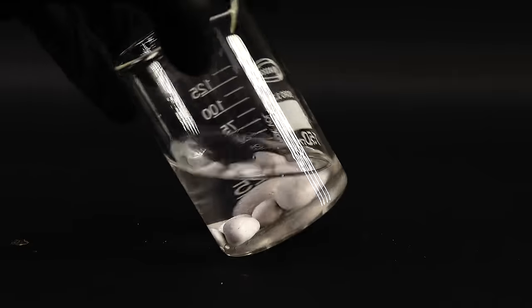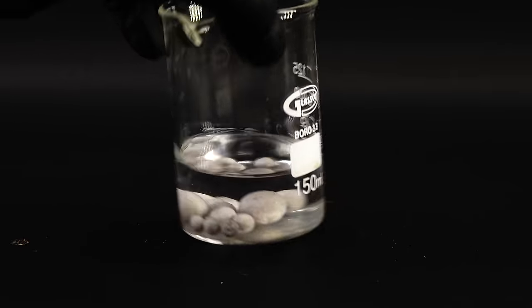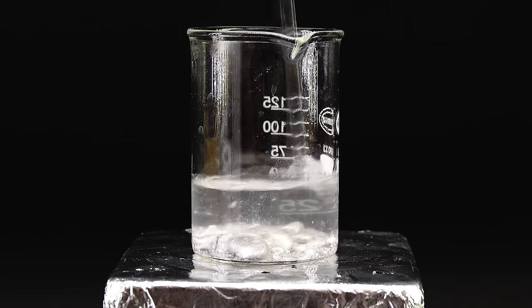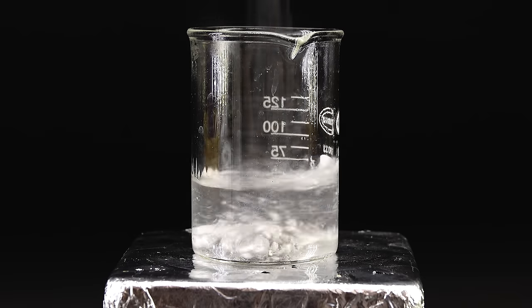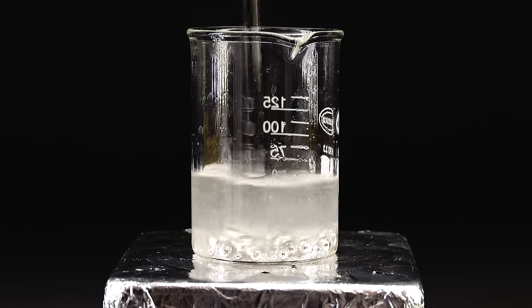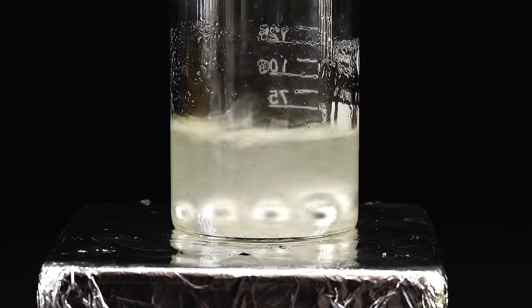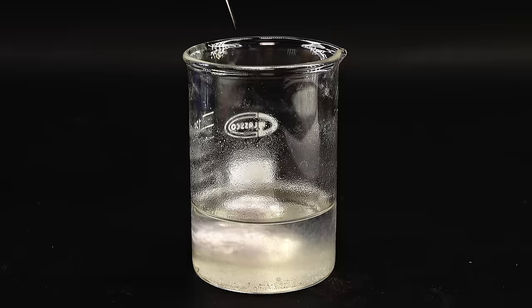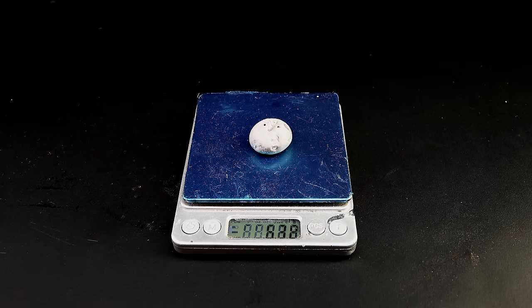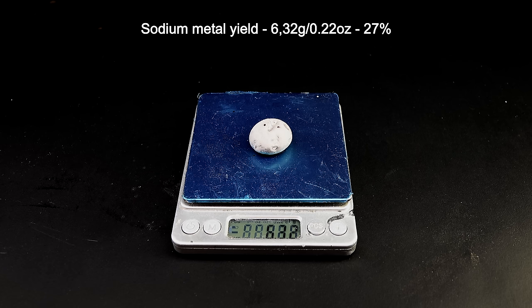I picked out all the sodium beads from the slag and got them into some mineral oil. I wanted to turn all my sodium into a single large bead, so I got the whole beaker onto a hot plate and melted the sodium by heating it up slightly. To coalesce everything, I added a tiny amount of isopropyl alcohol, which after a while made all the sodium really shiny and able to freely coalesce together. It eventually all turned into a single beautiful blob. After cooling it down and getting it onto a paper towel to remove the oil, it turned out that after all this struggle I got 6.32 grams of nearly pure sodium metal, corresponding to around 27% yield from 40 grams of sodium hydroxide.